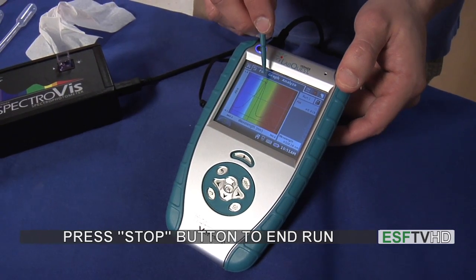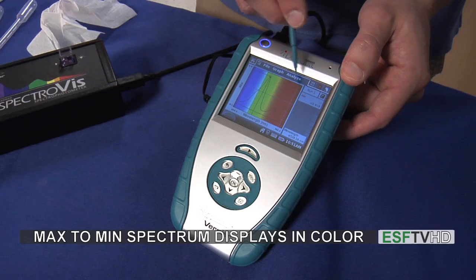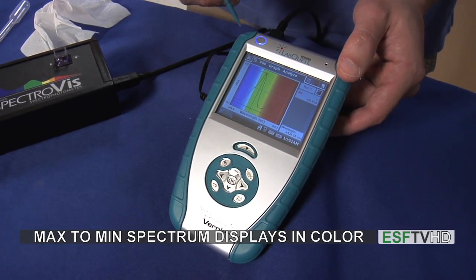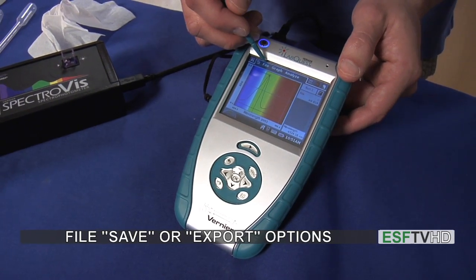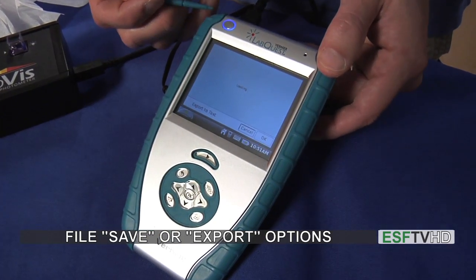Now it reads the maximum of the spectrum, as well as displays the whole spectrum with the color of the absorbance right behind it. That might be the end of the run — if I just wanted one simple absorbance spectrum, I would go to file and then save or export the file as needed.